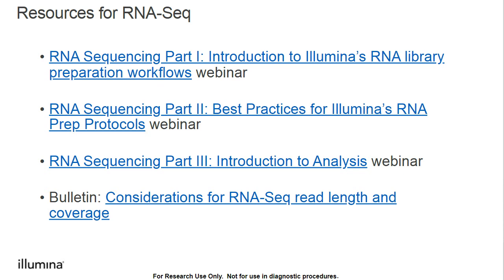And then part 2 is for those best practices for our Illumina RNA Prep protocols. And then part 3 talks about our introduction to analysis. So that's a great series if you want to see an end-to-end workflow and what that involves. And then we also have a great bulletin that talks about our considerations for RNA-Seq read length and coverage.